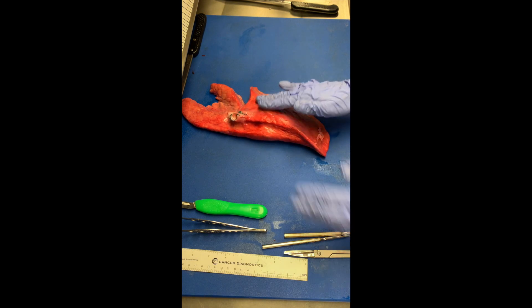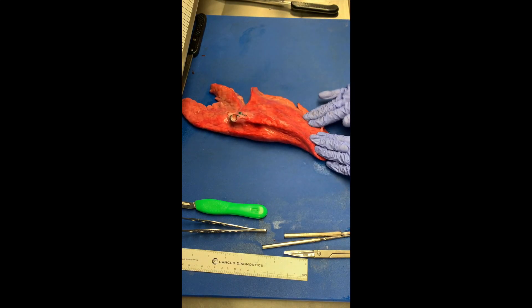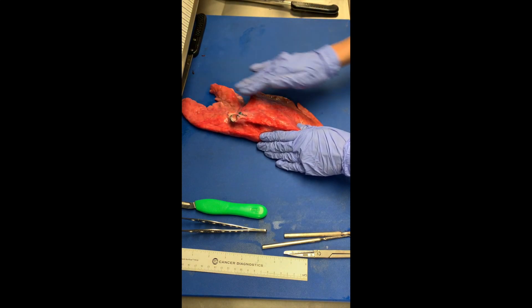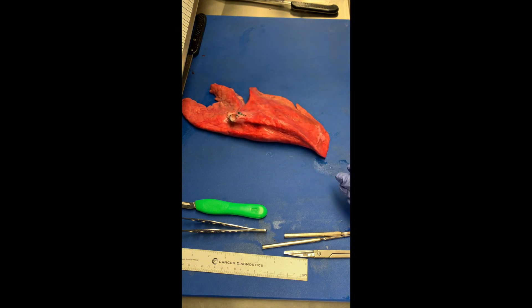The next thing you'll want to do is palpate for a lesion. Now your pig specimens will not have a lesion, so you can pick an area and ink it.